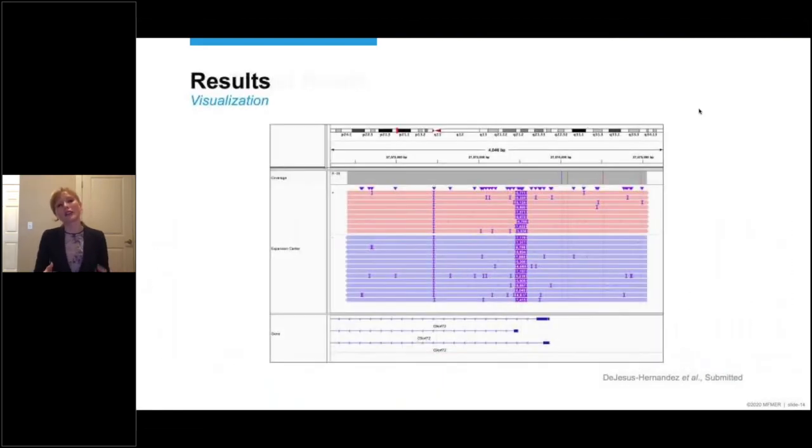We also visualized it using IGV, as shown on this slide. And again, it is the C9ORF72 locus. The expansion itself is shown in purple. And the number of reads is specified as white numbers. And you can see that the expansion is located either in the first intron or in the promoter region, depending on the transcript studied. And again, that is exactly what we wanted to see.